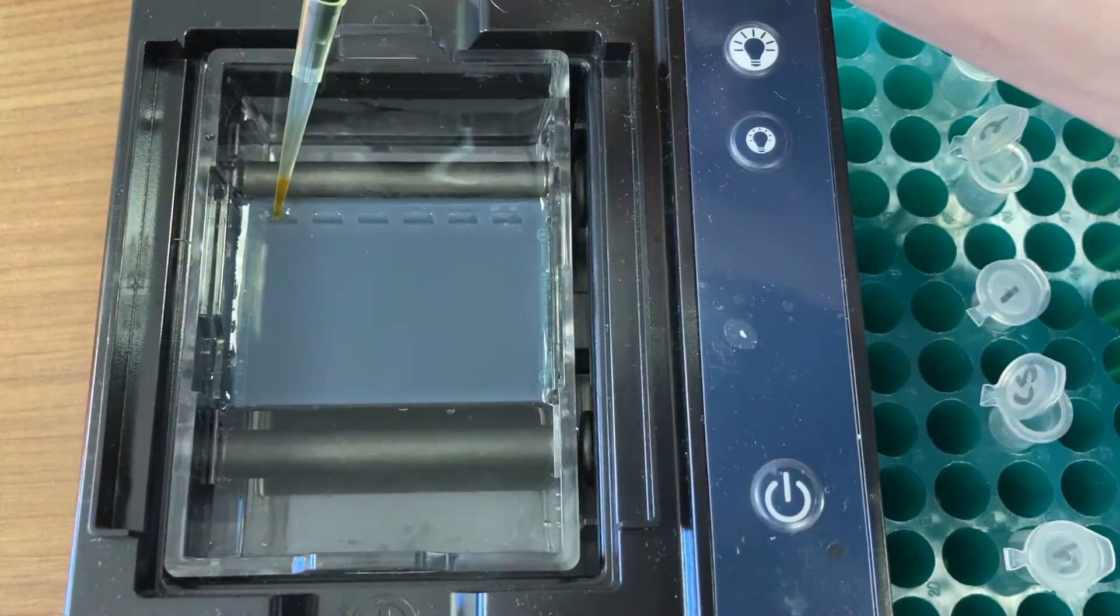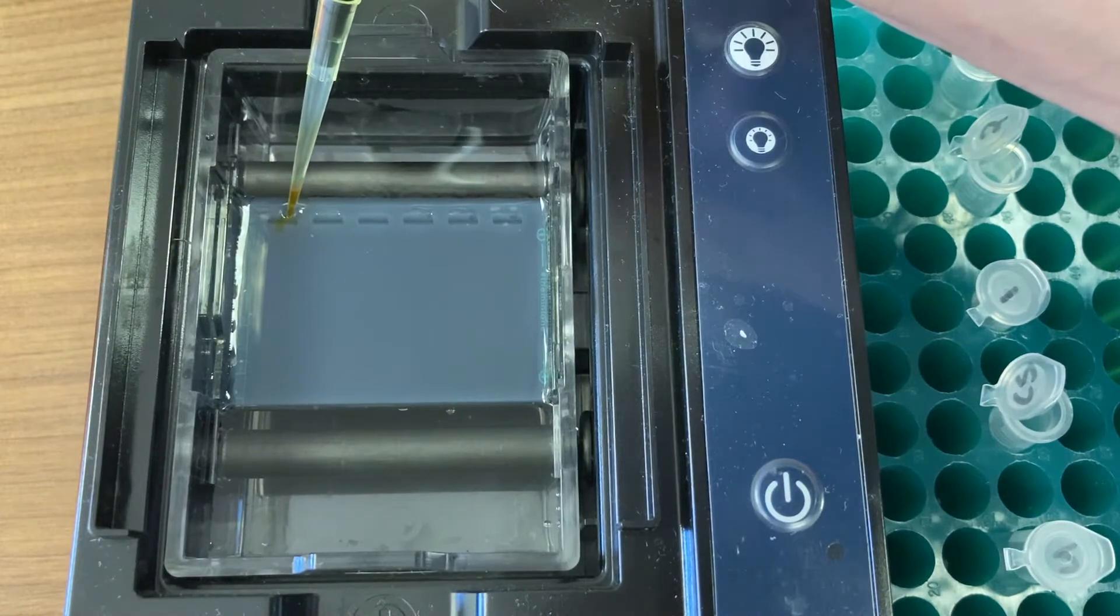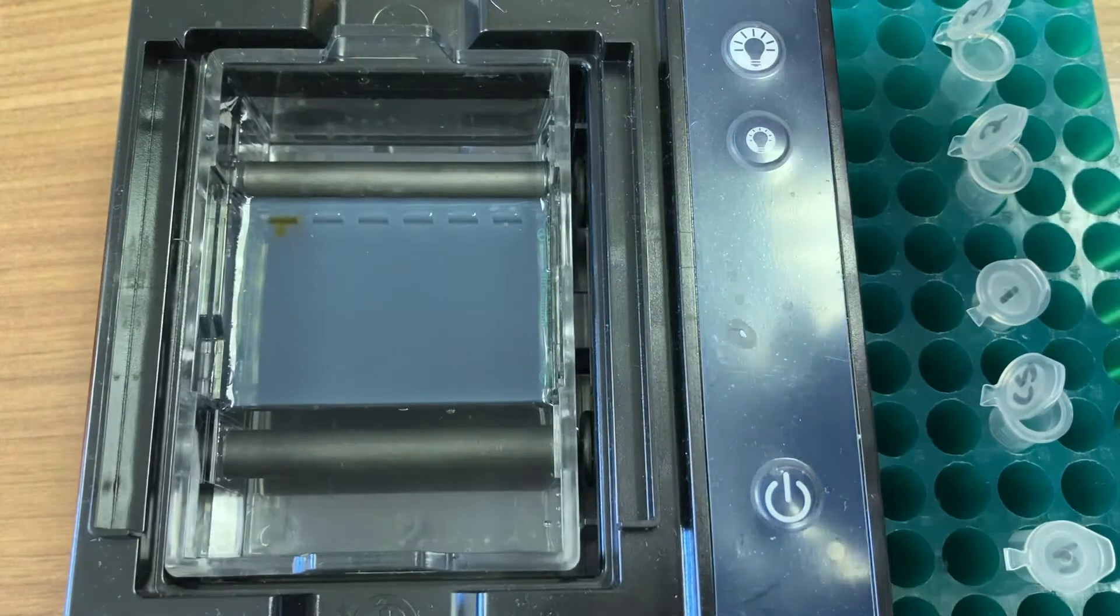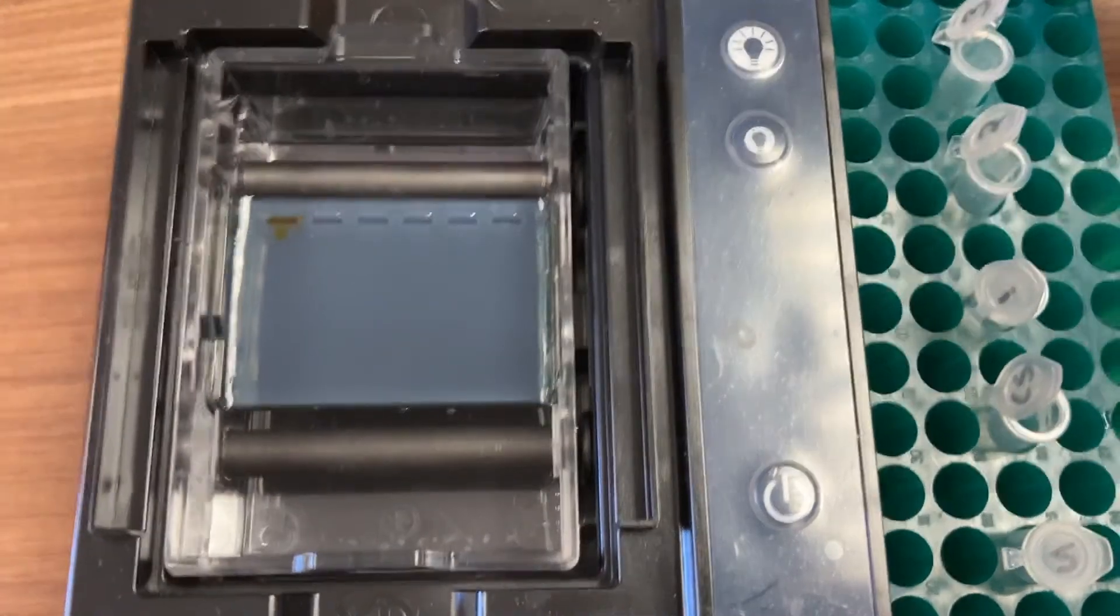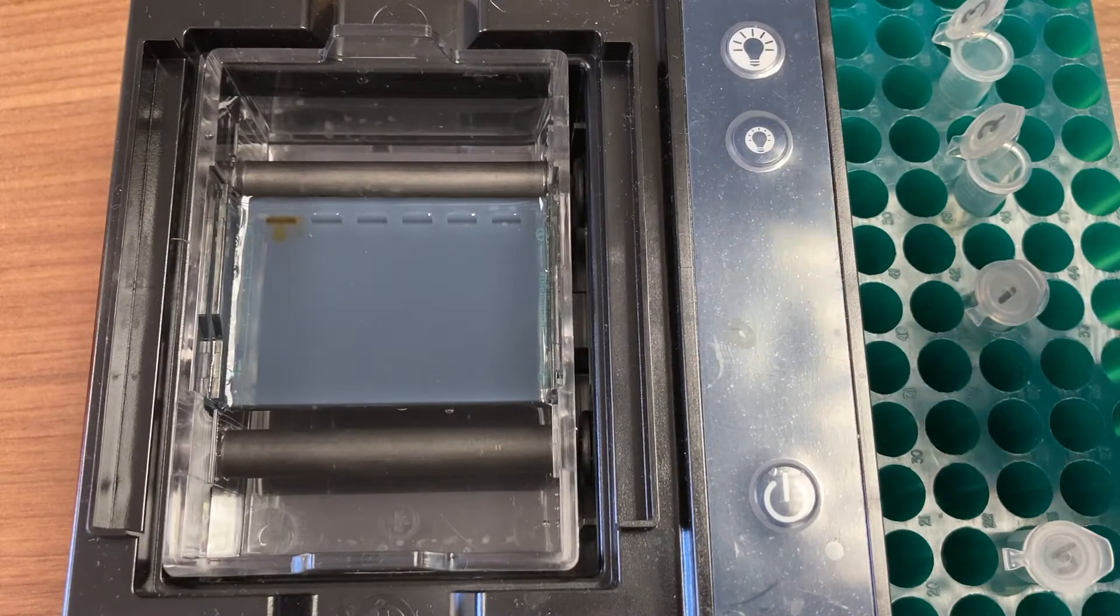You're going to use your micropipette to add 15 microliters for each sample. Make sure you switch your tips in between each sample so we don't want to mix up the DNA. As we continue loading our samples onto the agarose gel, we want to share a bit about this electrophoresis system.